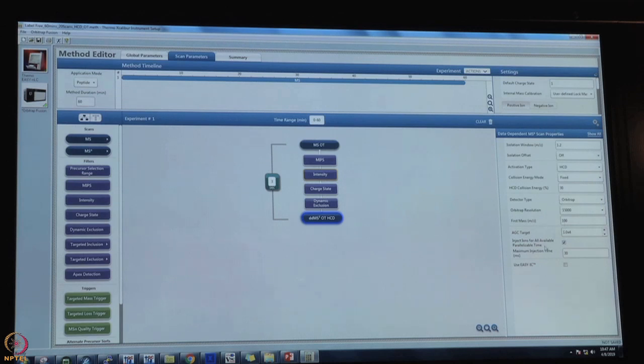So these are the parameters which I have shown you. These are already optimized for the label-free quantitation. If you are using a different technique, such as a label-based one like iTRAQ and TMT, accordingly those parameters will be changed, so you can change them accordingly. So this was the parameter for the LC and then the MS parameters.